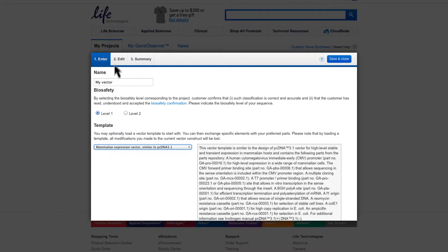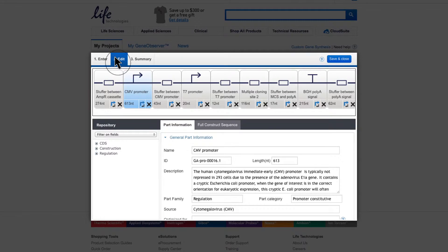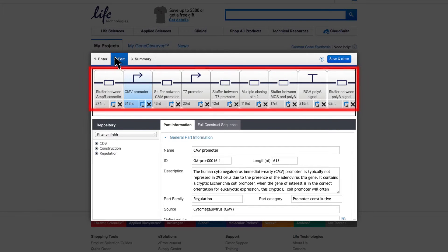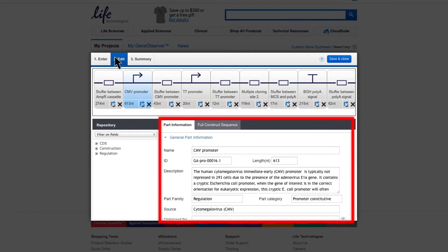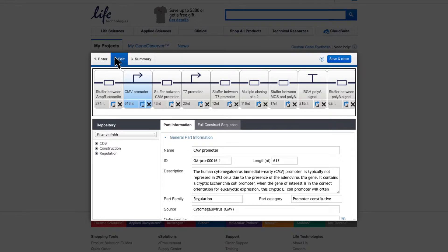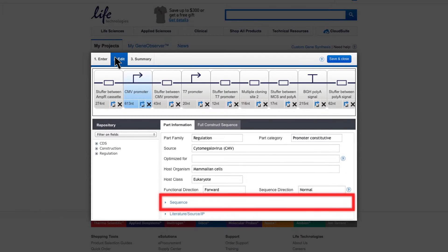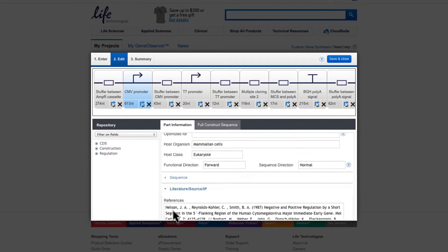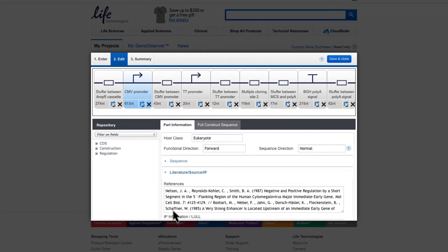Moving on to the Edit tab. The chosen template will appear within the Construction pane, broken down to its genetic elements. You can review the information provided for each element within the Information pane. Scrolling within the Information pane will allow you to review the sequence, references, as well as the intellectual property information found for the respective parts.